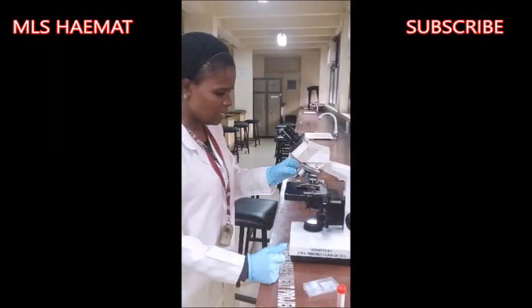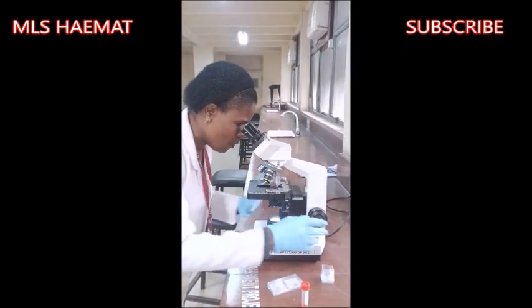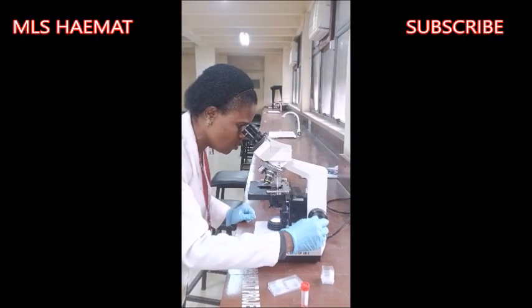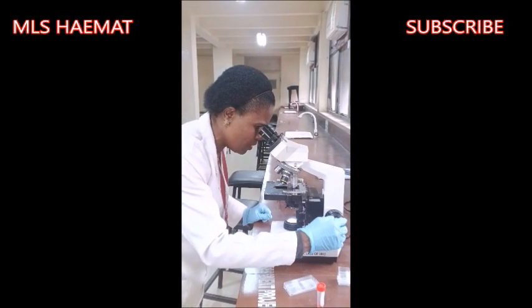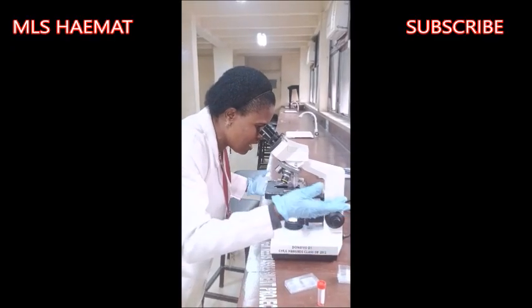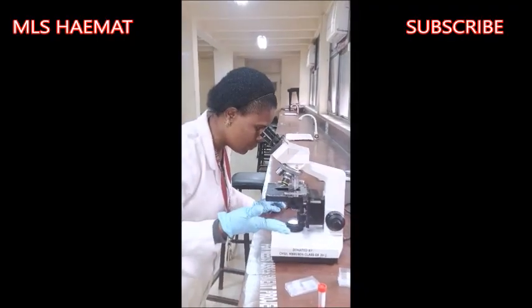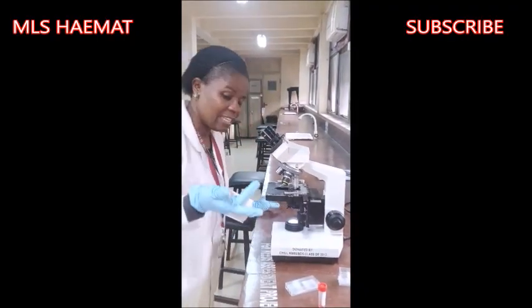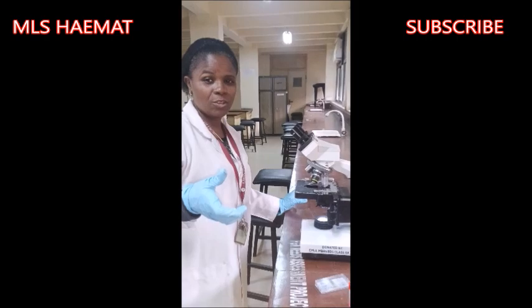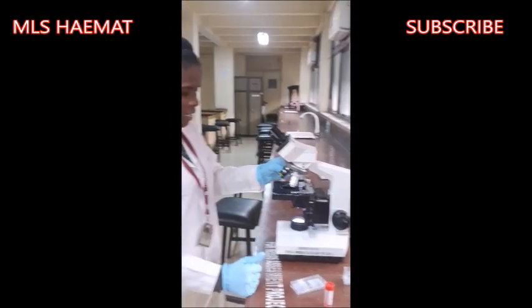So now I'm turning it to ×40. Once you turn to ×40, all you need to do is move the fine adjustment forward a little. And I have my focus already here. Once you've done that, the next thing is you want to go to the ×100 objective lens, because that's where we're going to do the activities that we need to do.